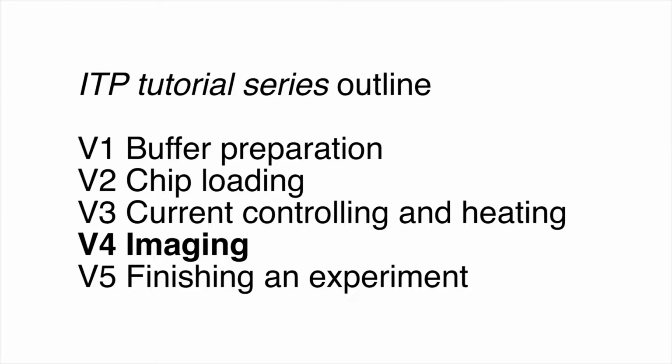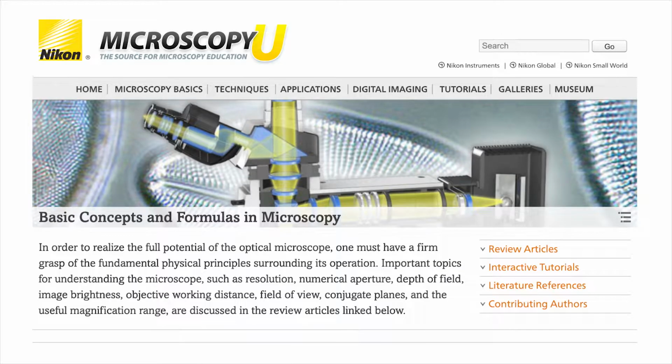This video discusses the operation of the microscope, camera, and camera software. Before we begin, we encourage you to check out the Microscopy U tutorials linked in the supplementary document. Let's talk about the microscope setup.